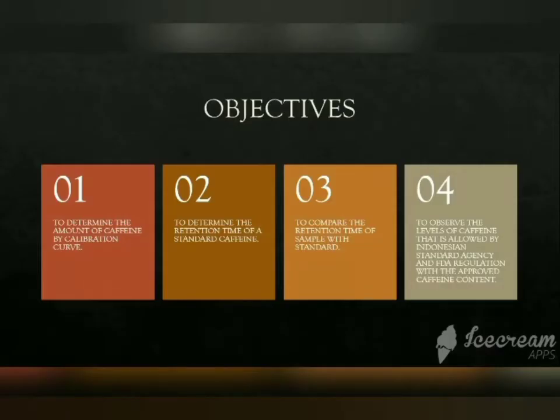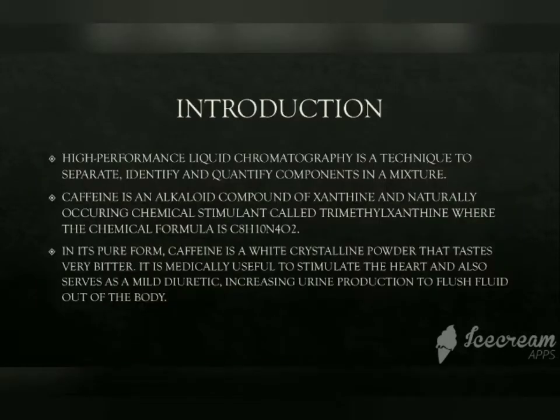There are 4 objectives in this experiment, such as to determine the amount of caffeine by calibration curve, to determine the retention time of the standard caffeine, to compare the retention time of sample with standard, and to observe the levels of caffeine that is allowed by Indonesian Standard Agency and FDA regulation with the approved caffeine content. Next, we move to introduction.